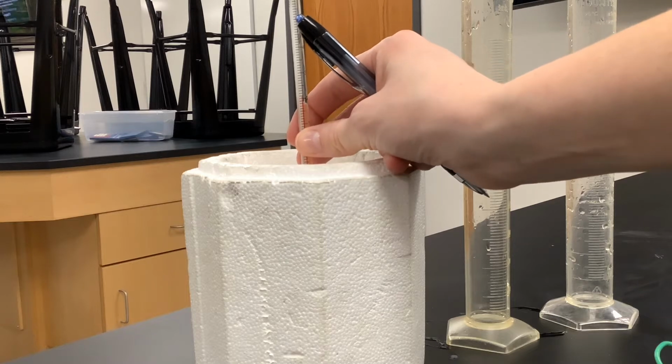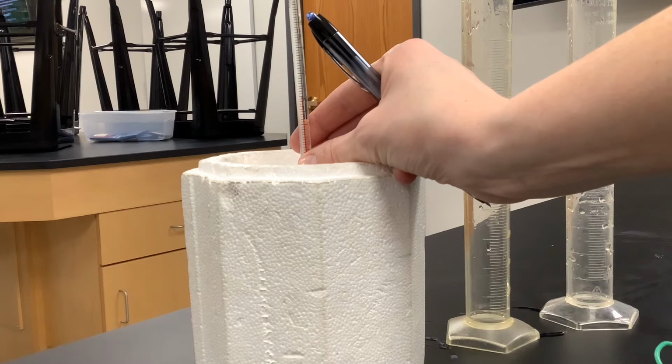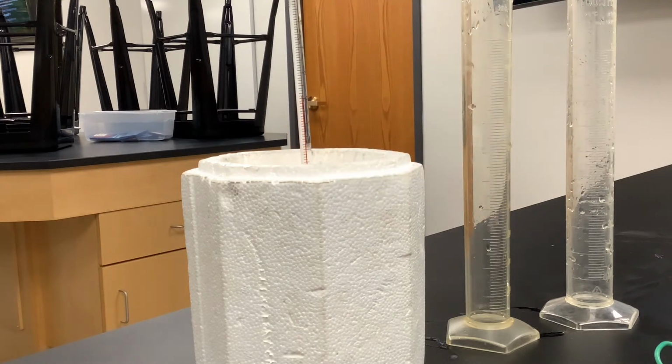Next thing I want to do is take the initial temperature of the calorimeter water. Whenever I'm taking a temperature, I want to wait, make sure it's not adjusting anymore, so I'm taking an accurate reading. And it looks like it's pretty steady at 21.5. So initial temperature of calorimeter water is 21.5 degrees Celsius.